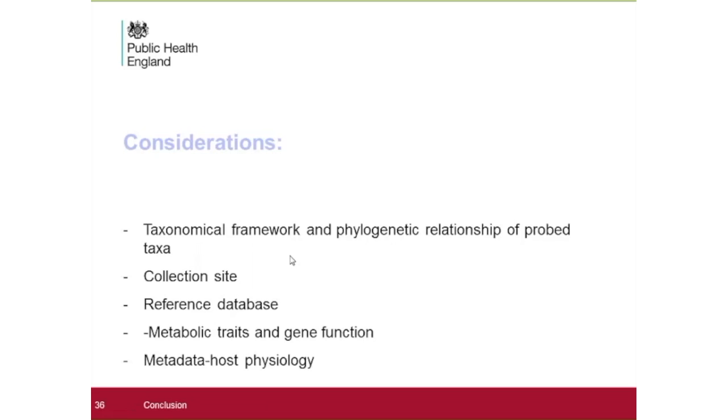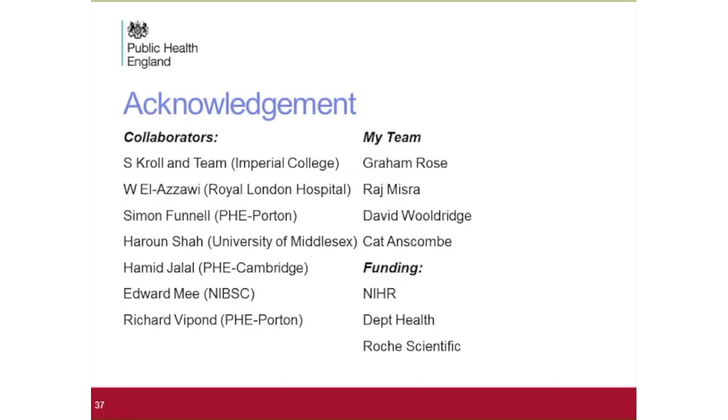I do hope that I have highlighted some of the considerations on the physical processing of samples, the collection of samples, what is a reference data set, and what are the comparative processes that would allow us to move forward to characterizing a core flora or core gene as we move forward in this area.